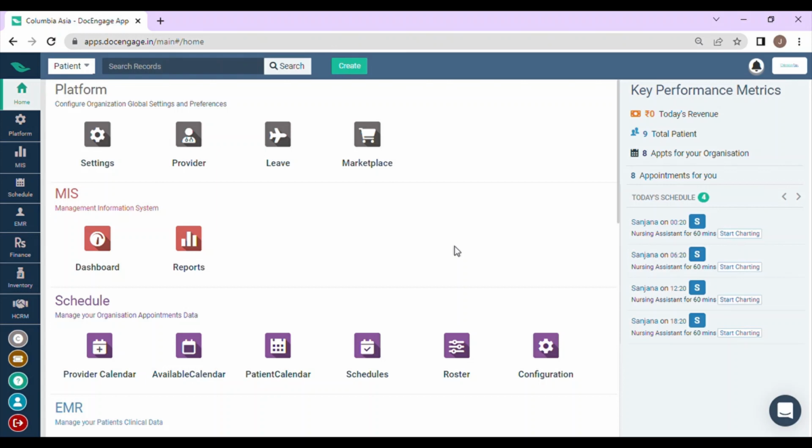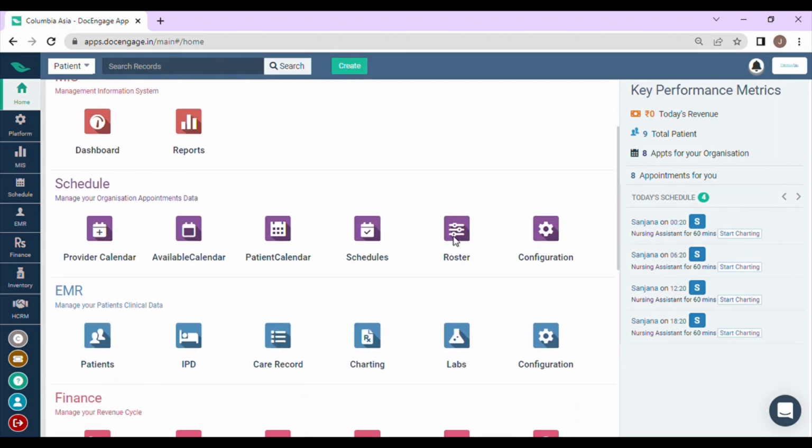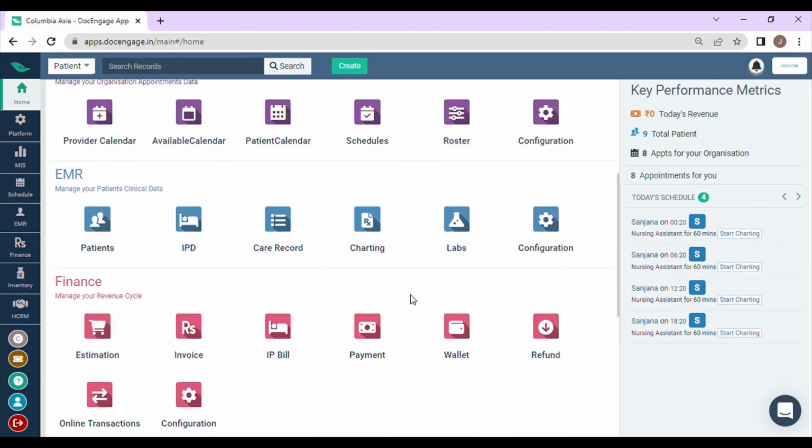This is Jayashree. In this video, I'm going to tell you about labs. Labs is generally to manage the diagnostic center where you can manage the lab test and lab results of the patients. So let me show in this video, I'll show you how to add the lab test and the results.